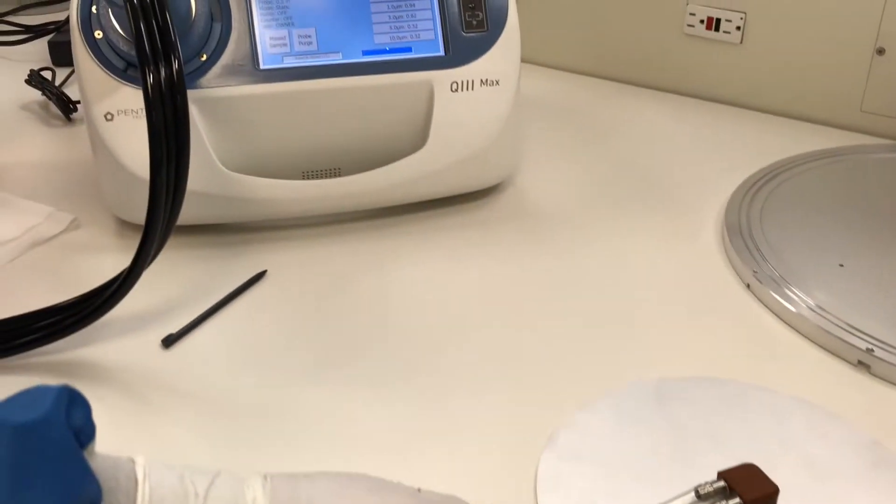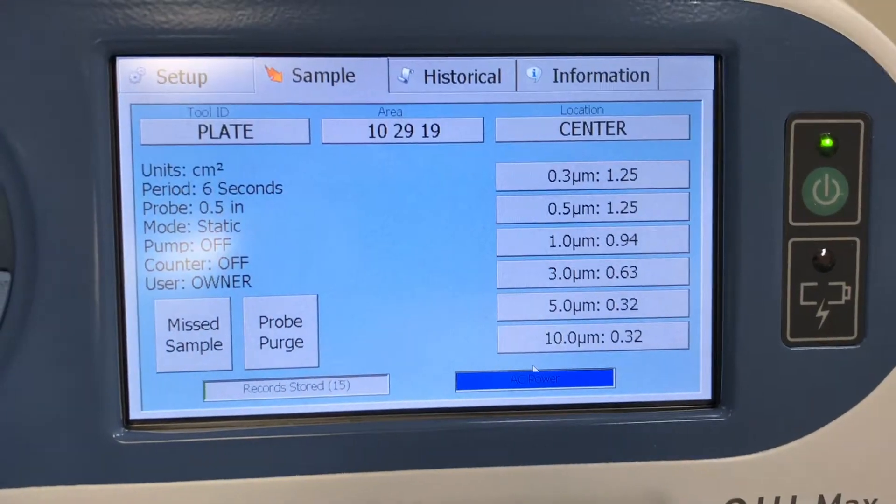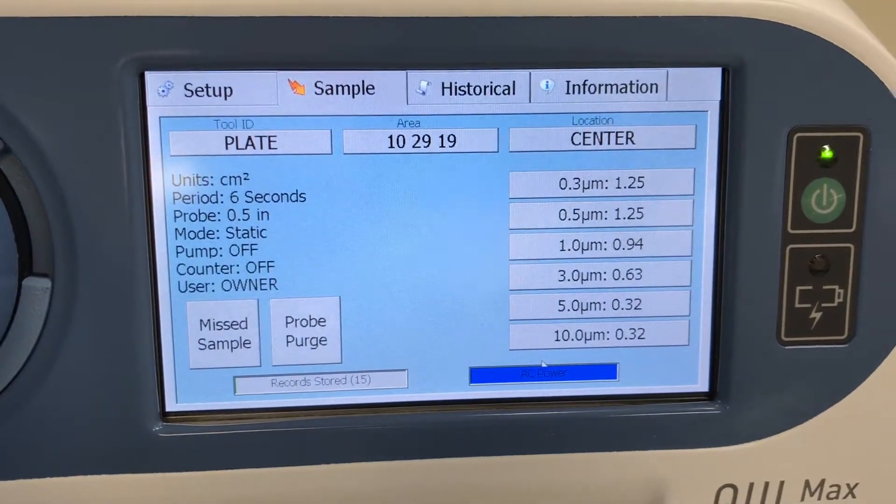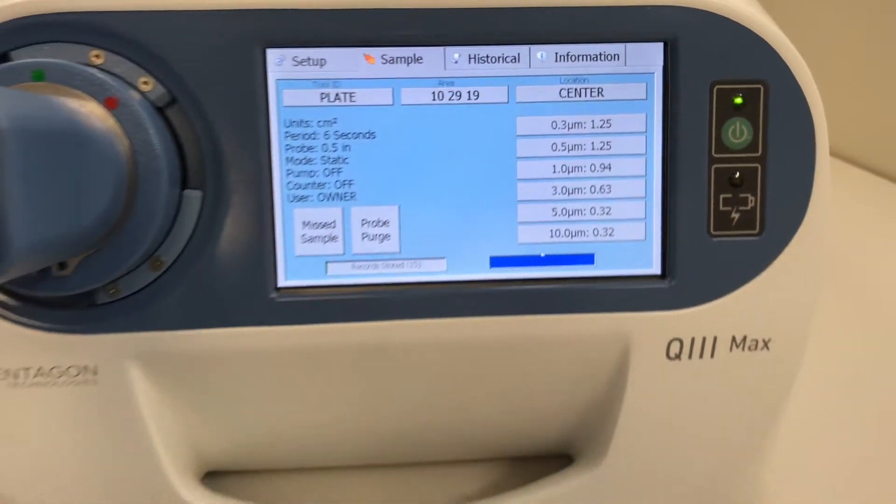After the second wipe, the results show 1.25 particles greater than 0.3 micron per centimeter squared were detected in six seconds.